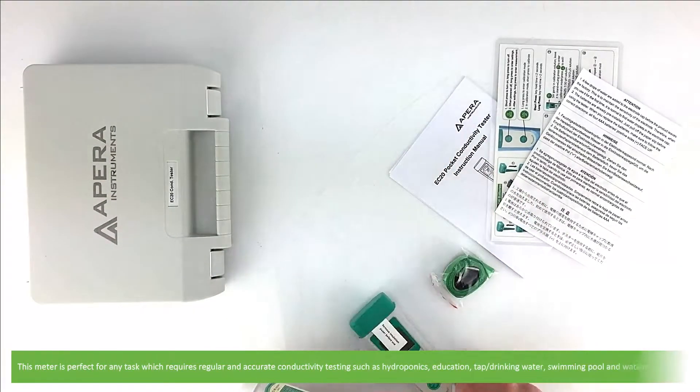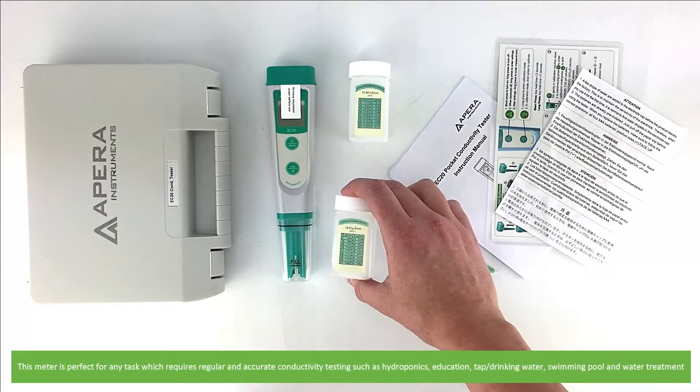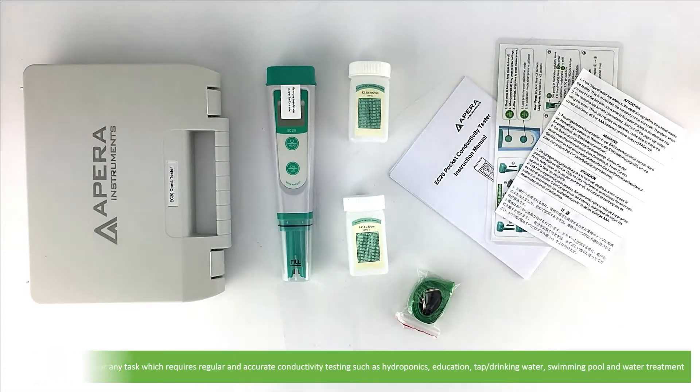This meter is perfect for any task which requires regular and accurate conductivity testing, such as hydroponics, education, testing, drinking and tap water, swimming pool maintenance and water treatment.